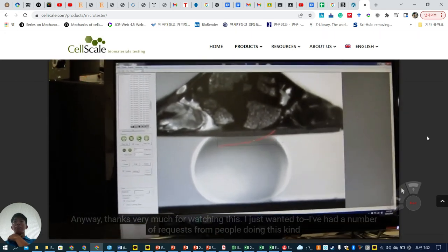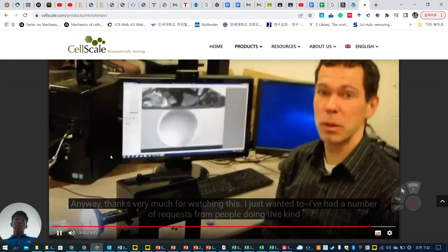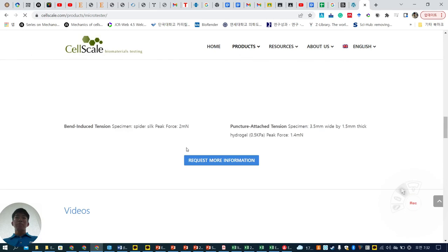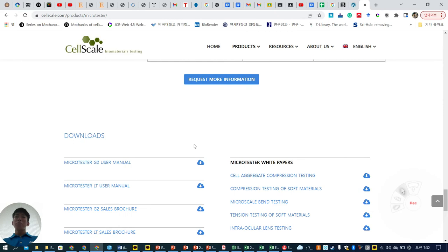Anyway, thanks very much for watching this. I just wanted to have a number of requests for people doing this kind of work. They can measure creep, stress relaxation, and then cycling mode also, it can work. Same as our instrument. So anyhow, this machine, maybe 2 months later it will come.